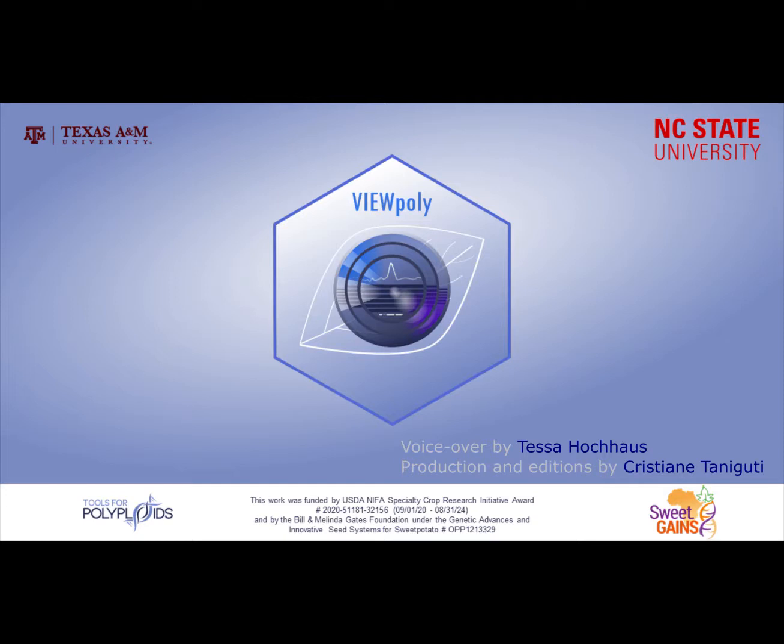Hello everybody, I'm here to introduce to you the shiny app in our package, VIEWpoly. This tool is part of the Tools for Genomics-Assisted Breeding and Polyploids project.